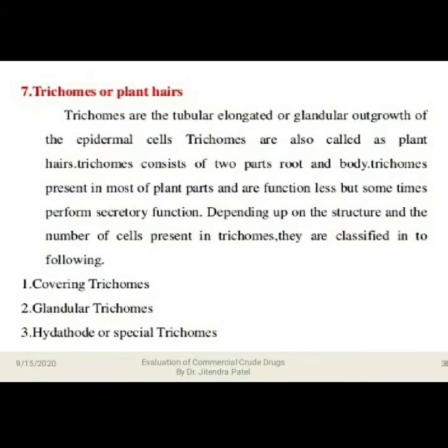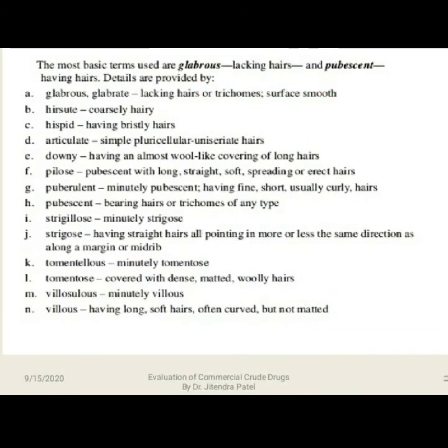Depending upon the structure and the number of cells present in a trichome, with more cells, definitely they are going to be involved in physiological actions like secretion, right? They are classified into the following: covering trichomes, glandular trichomes, and special trichomes. The most basic terms used are glabrous, lacking hairs or having fewer hairs, and pubescent, having hairs. So you can see the details are provided here.